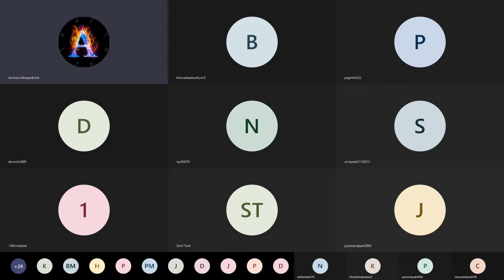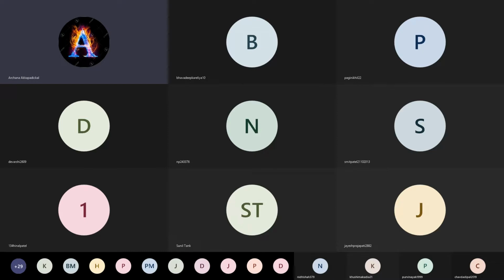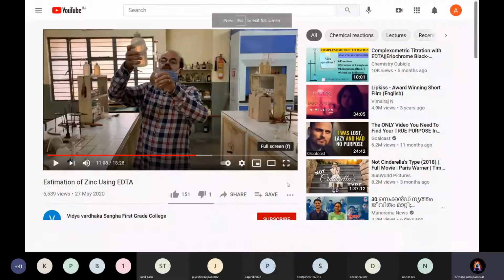many students, like some students actually find it difficult उसमें pipette डाल के collect करना, they find it difficult. So what do they do? ये जो volumetric flask में जितना भी solution बनाया उसको transfer कर देते हैं beaker में, which is very wrong. Once you are given a volumetric flask, do not transfer your sample to anything else. That leads to error. Or you have to take out your unknown sample every time using a pipette only.